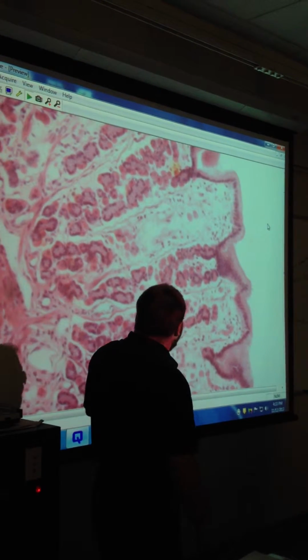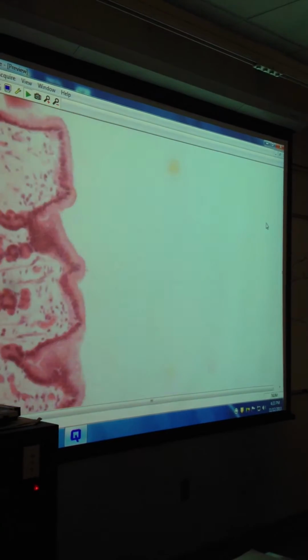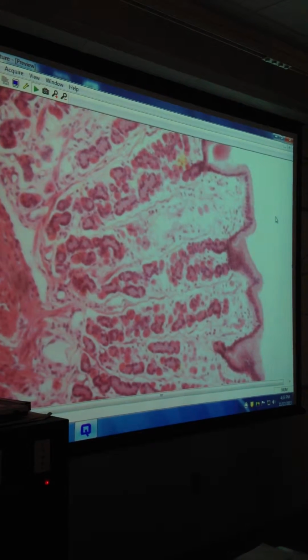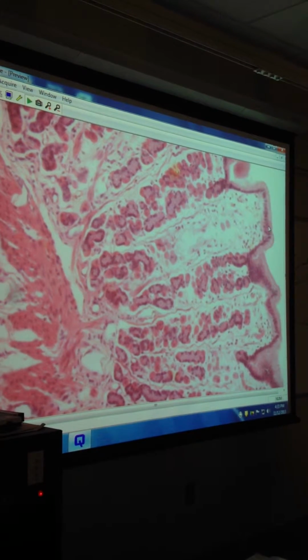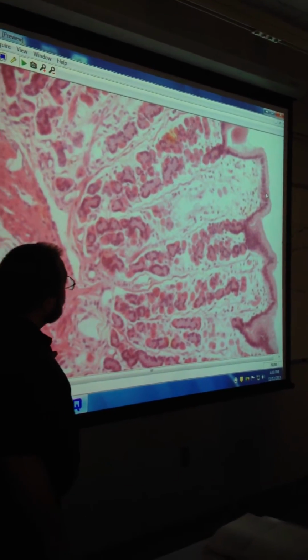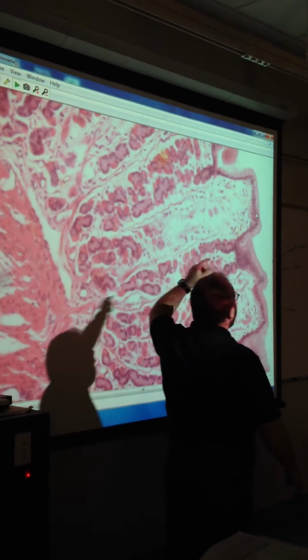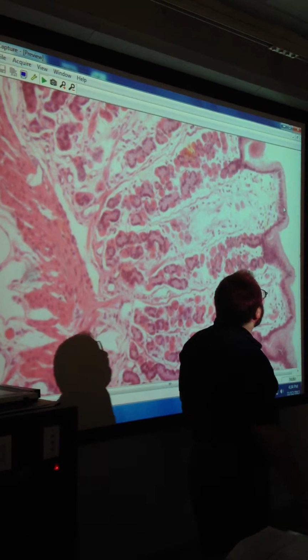these are all gastric glands. Can you see how there are 2 different kinds of cells there? The white arrow, is that on the simple epithelium cell right now? Yeah, on the top there. The white arrow happens to be right on the simple columnar epithelium. Thanks.